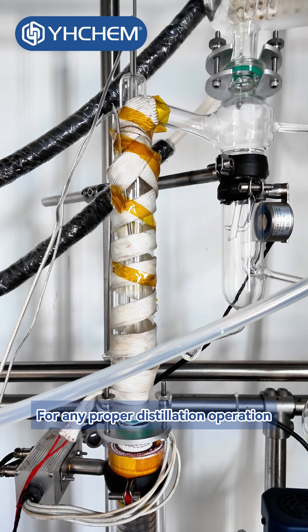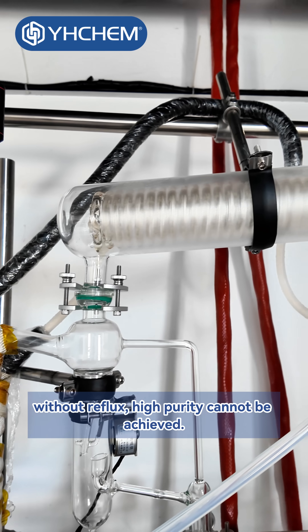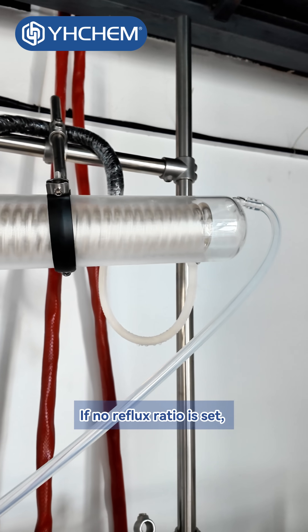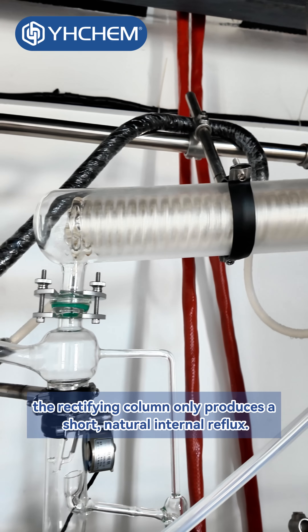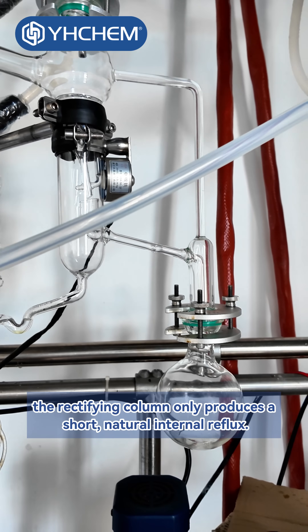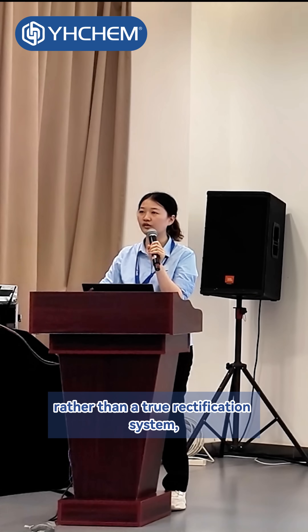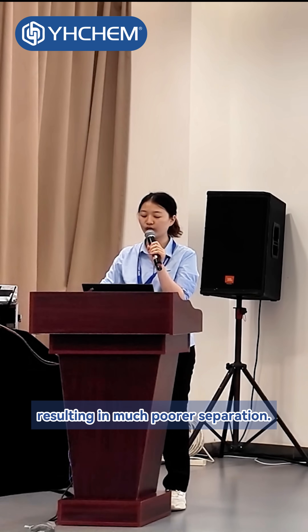For any proper distillation operation, reflux is essential. Without reflux, high purity cannot be achieved. If no reflux ratio is set, the rectifying column only produces a short, natural internal reflux. In that case, it functions more like a mist separator rather than a true rectification system, resulting in much poorer separation.